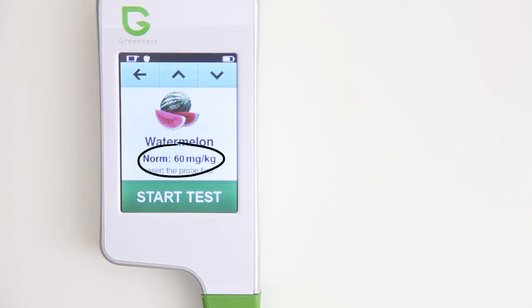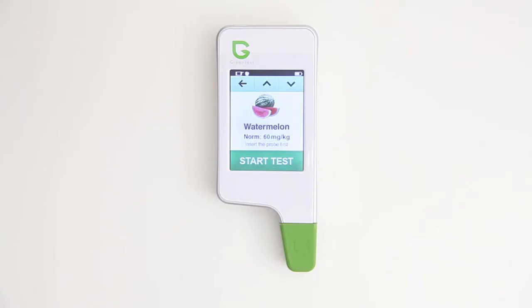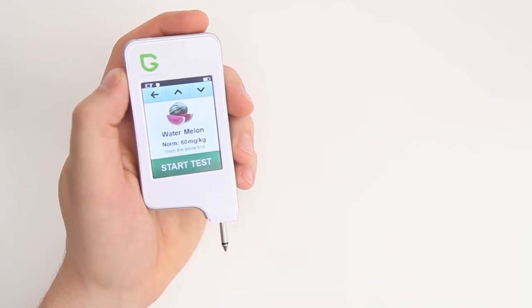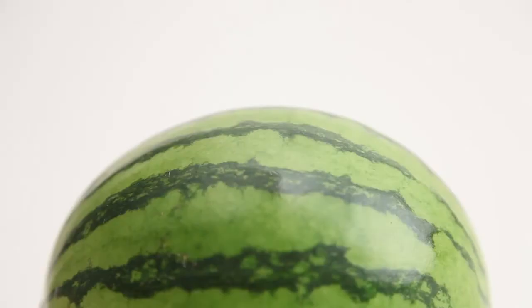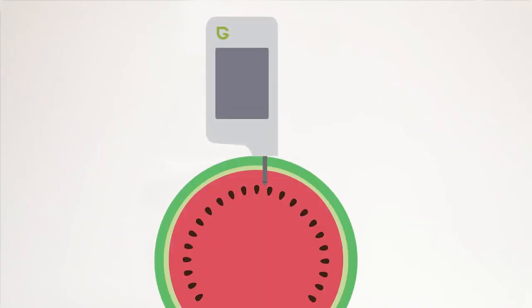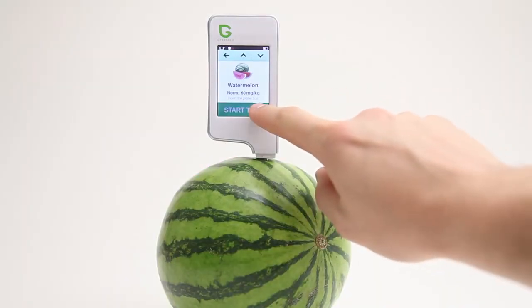Let's test our melon. Remove the cover and clean the probe with a dry cloth or tissue every time to get the most accurate readings. Insert the probe into the fruit or vegetable, ensuring that the top of the probe is inserted into the flesh and has fully penetrated the outer layer. Then press start and hold the device steady to get the most accurate results.